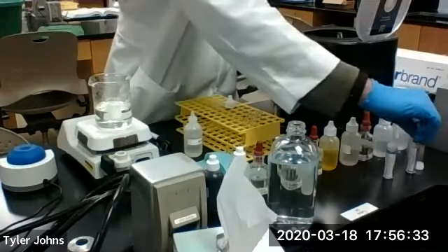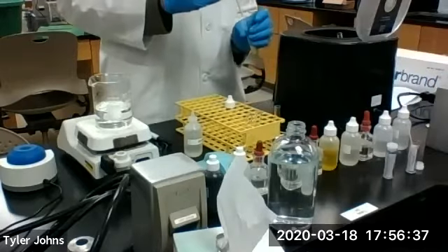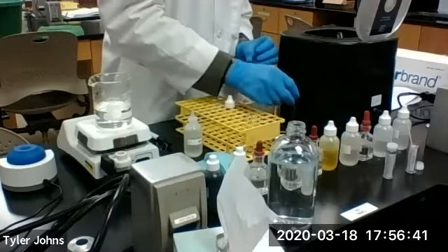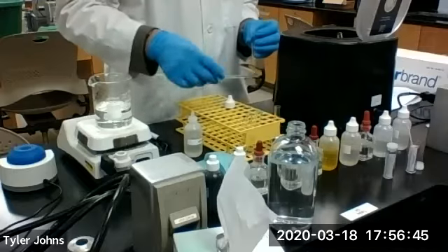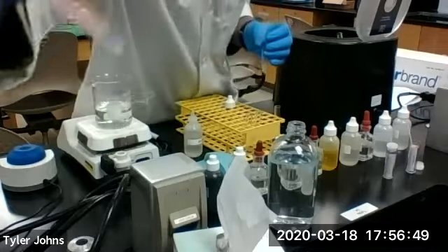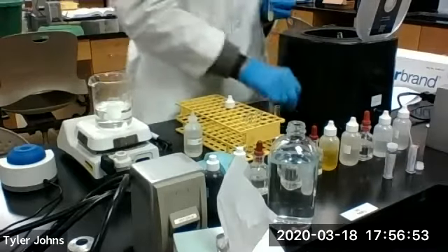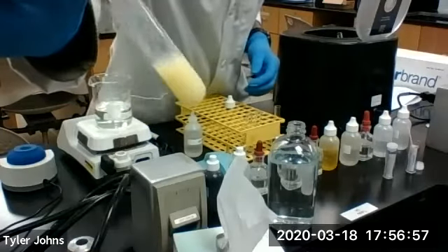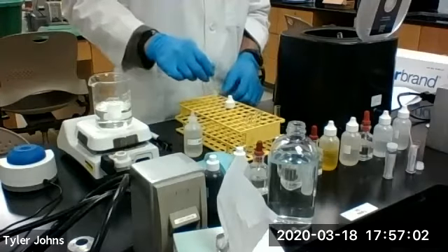I'm going to check the pH. They are indeed alkaline. As you can see, we have some precipitate forming. We will let this stand for 2 or 3 minutes.